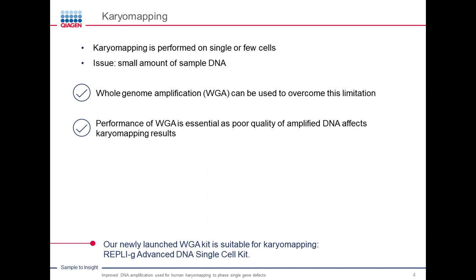And really, the final data that we get from a karyomapping analysis is dependent on the performance of the whole genome amplification, as this is essential to the quality of the data. You can imagine that as we talk about these really important applications, we need kits that allow us to definitely amplify the DNA, make enough of the DNA, and then amplify it faithfully so we don't introduce any abnormal changes.